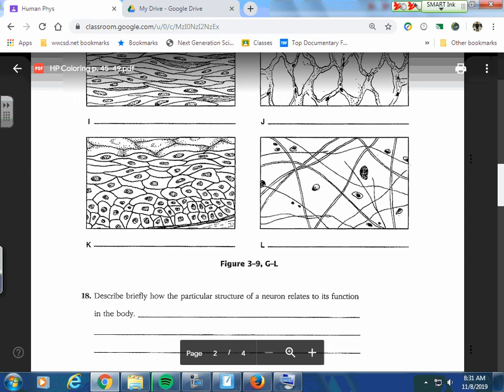All right. This looks kind of familiar. I see some flattened cells. We saw flattened cells up there with smooth muscle. But this, with the multiple layers going like that, this is going to be epithelial. And we can see here, it's got underlying tissue that's different. Might help us understand the lined surfaces. This is going to be many layers with the cells at the top flattened. This would be stratified squamous, like skin.